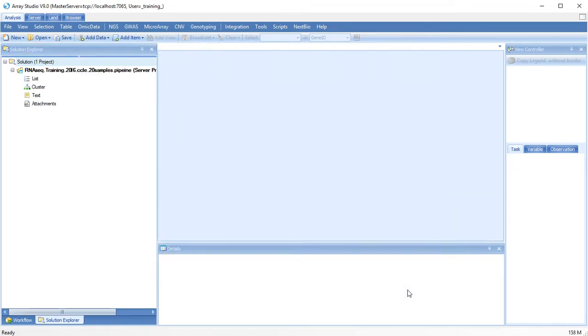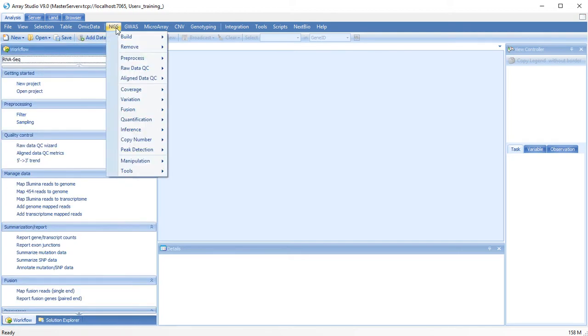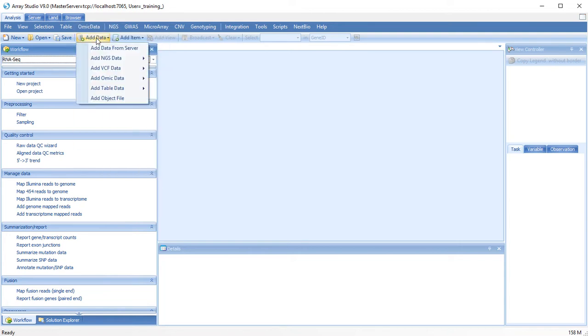To perform the RNA-Seq analysis, you can either follow the workflow, run each individual module, or you can run the pipeline.